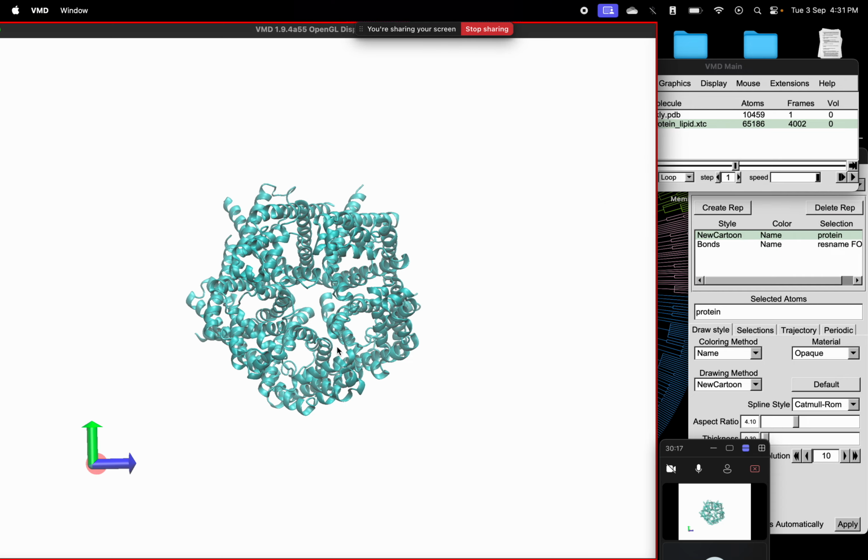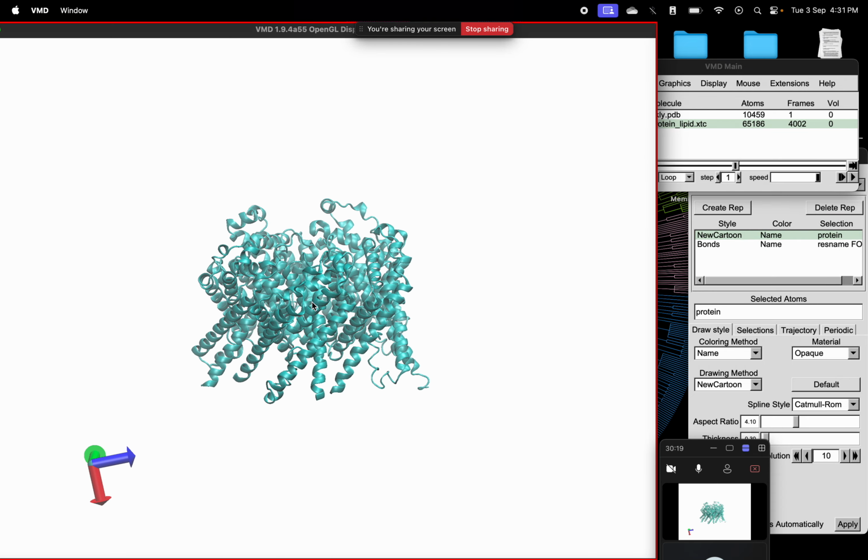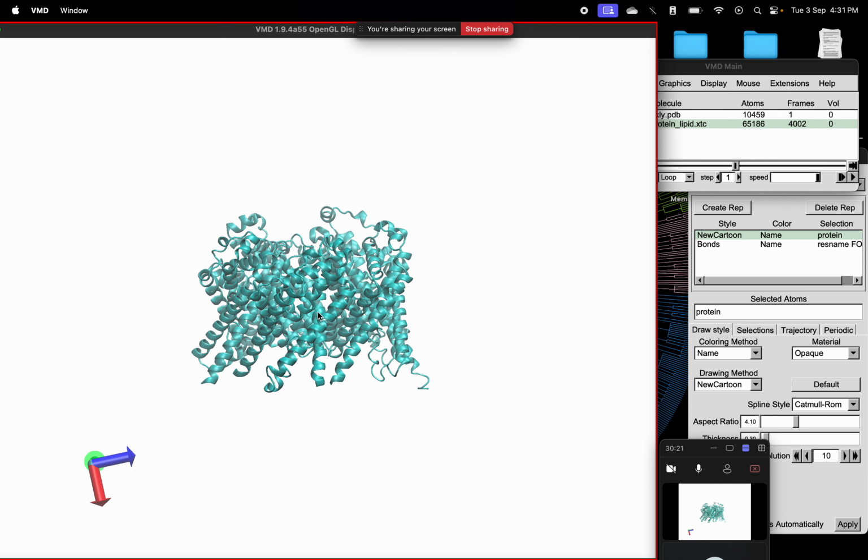So what other features can we learn from this protein? What I'm doing here is simply visualizing a 3D structure. As I told you, VMD is predominantly used for understanding and visualizing simulation trajectories. How a simulation trajectory works, without going into too much detail or technicalities, is that we do what we cannot do in experimentation.